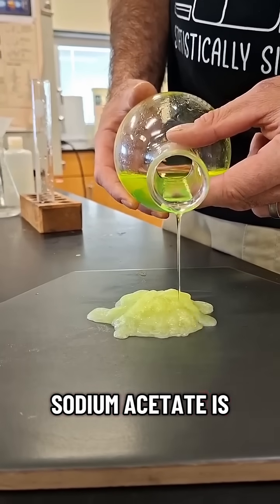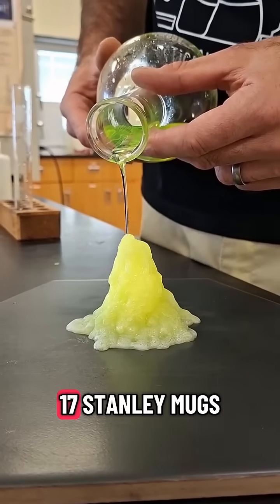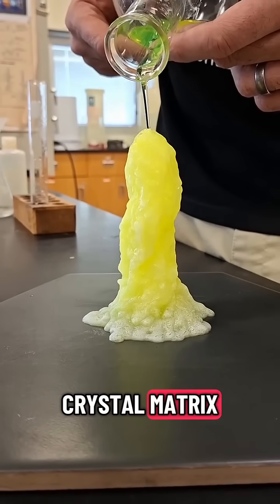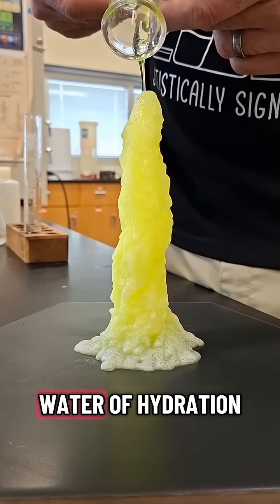Now sodium acetate is a hydrated crystal. That doesn't mean she works at Planet Fitness and owns like 17 Stanley mugs she doesn't even use anymore — although she does crash out. It means there's water inside its crystal matrix, and when you heat it up, if you're careful, you can get it to dissolve in its own water of hydration.